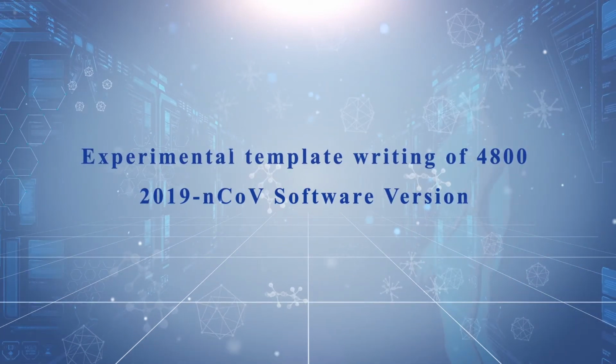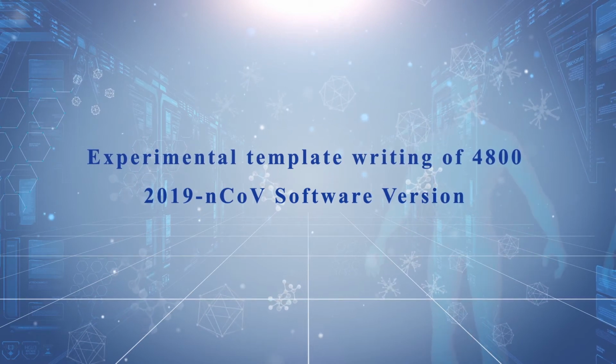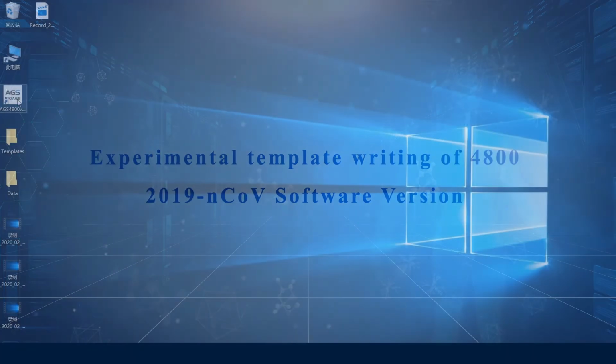Experimental template writing of the 4800 2019 Novel Coronavirus software version.